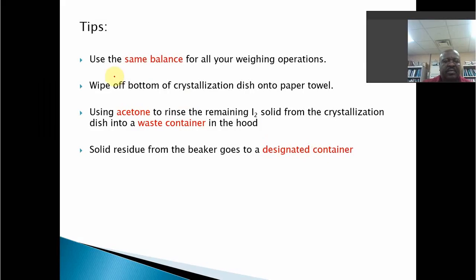Some useful things. Useful to use the same balance because in that way, you're minimizing balance differences. And at the end, you'll have the I2 at the back of that dish. You want to wash it with acetone. Acetone is a good solvent. And all of this will then go in a waste container in the hood. So the way we've done it is all of these operations occur in the hood. By the time you take out the beaker to weigh it after the heating, I want to make sure that all the I2 is gone.